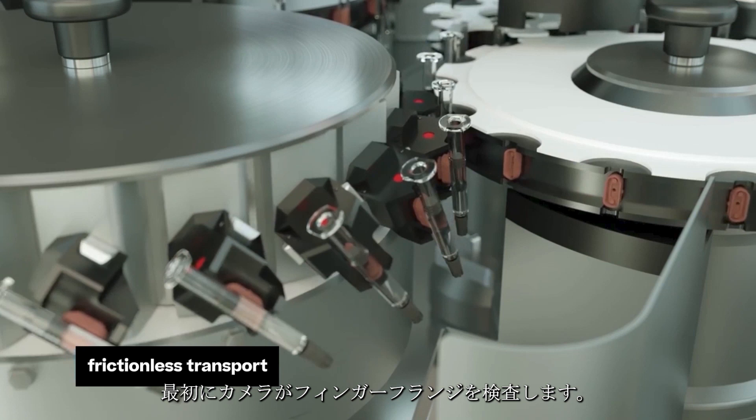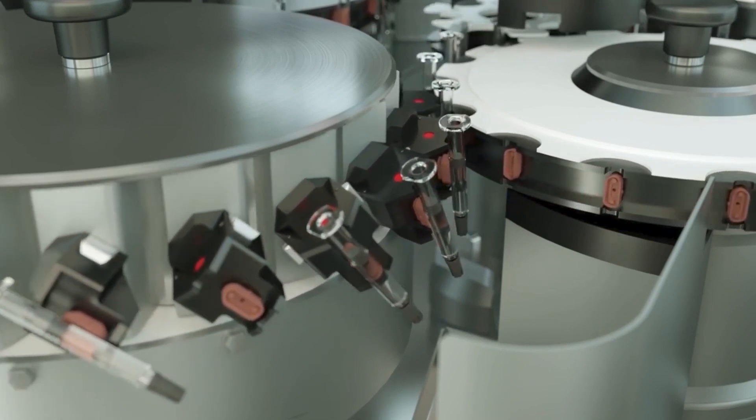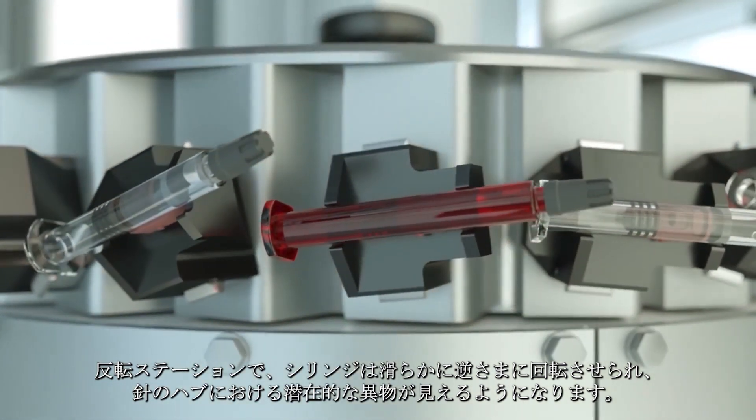A camera inspects the finger grip right at the start, and defective syringes are removed immediately. At the turning station, the syringes are smoothly turned upside down and potential particles at the needle hub become visible.